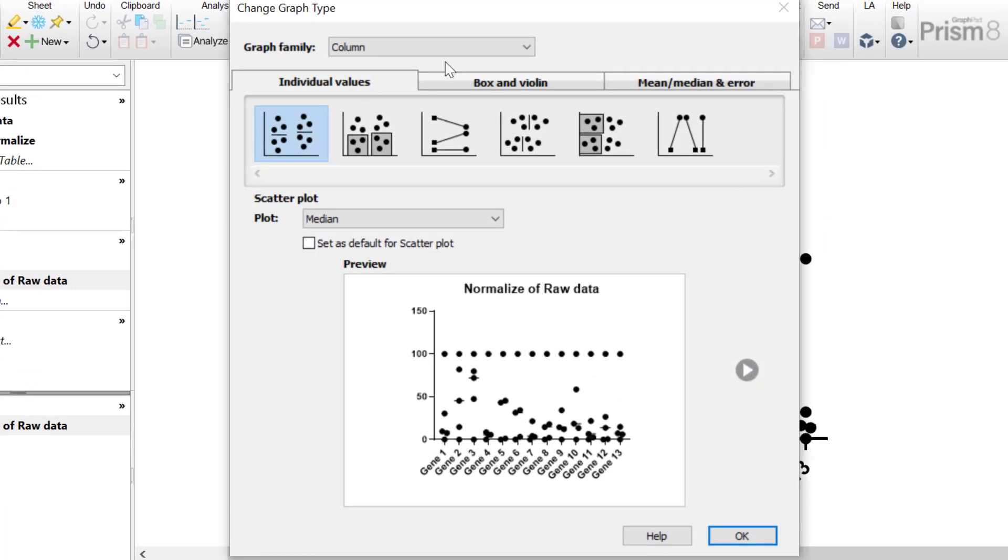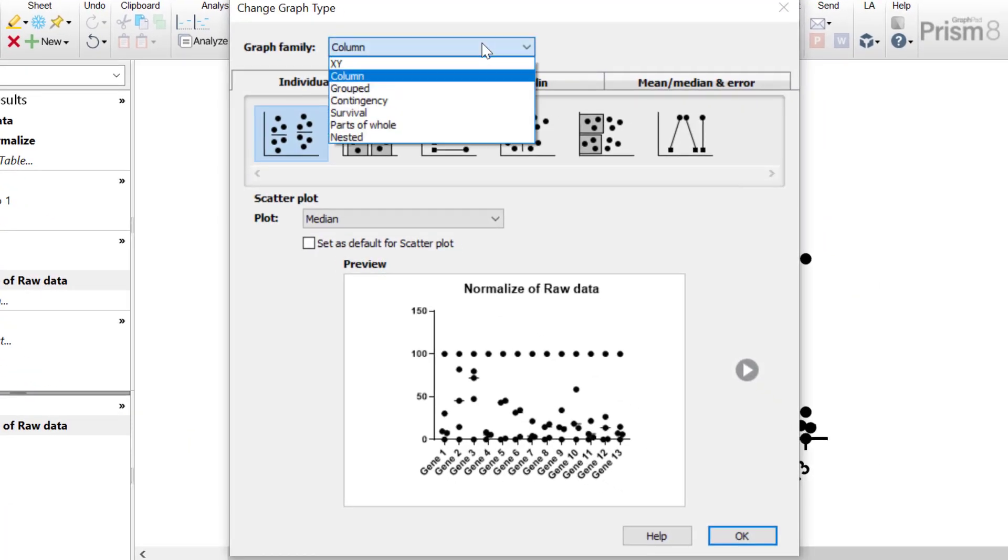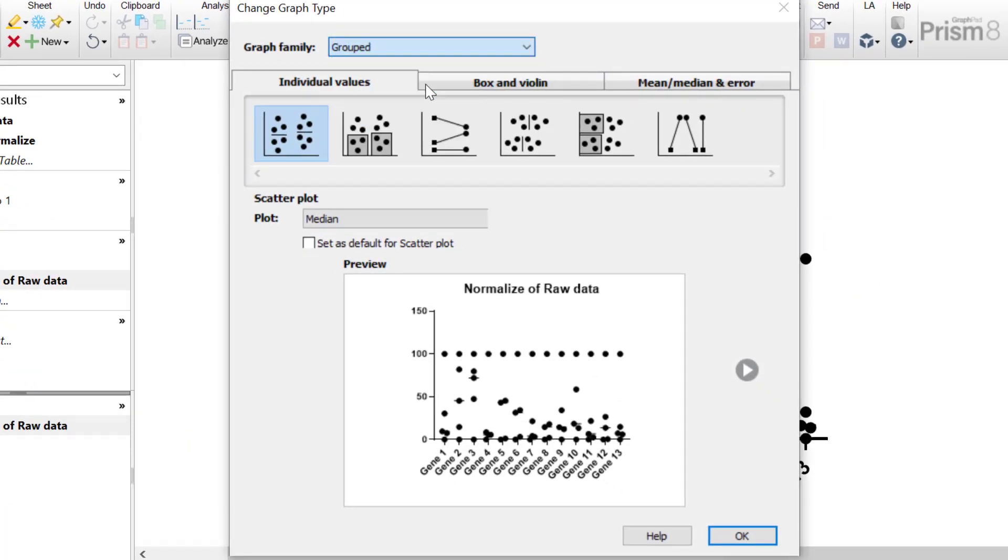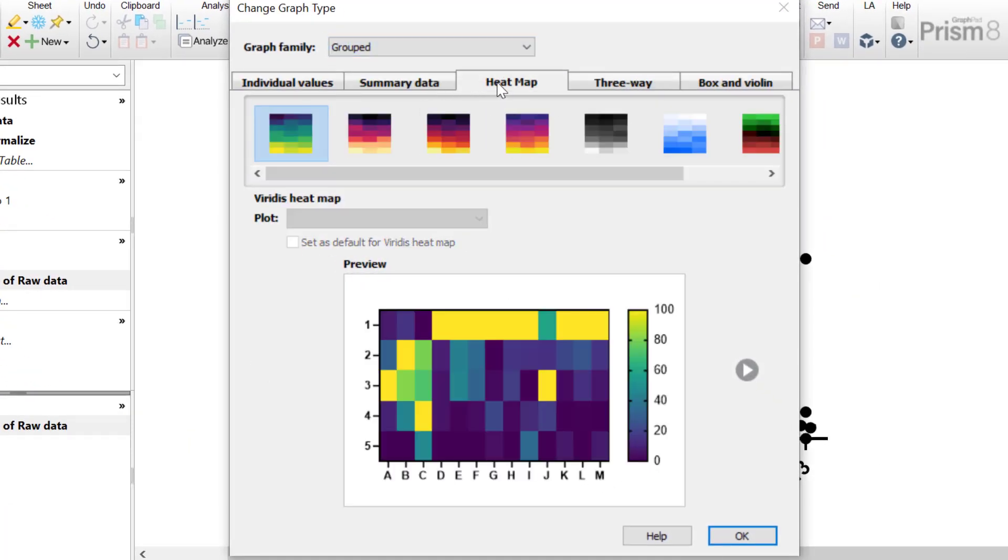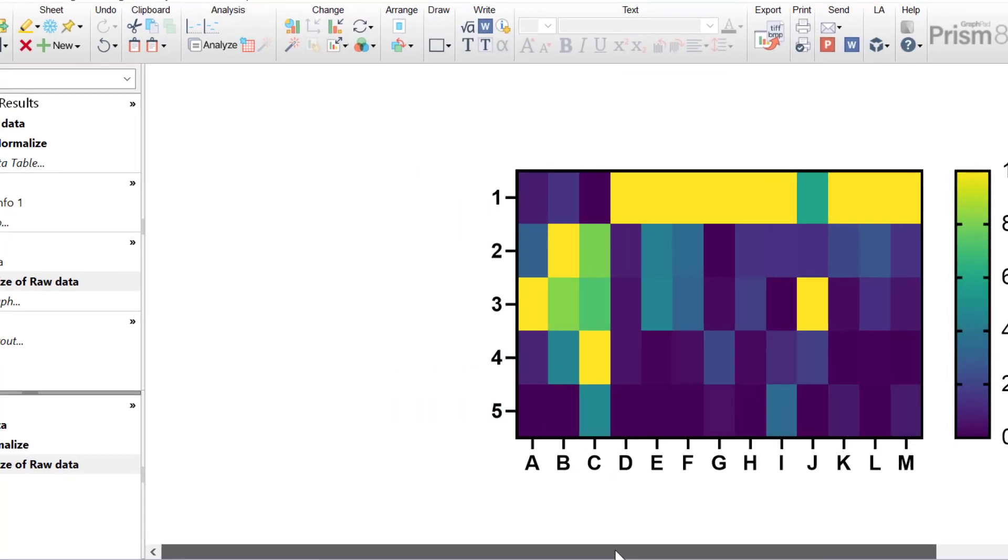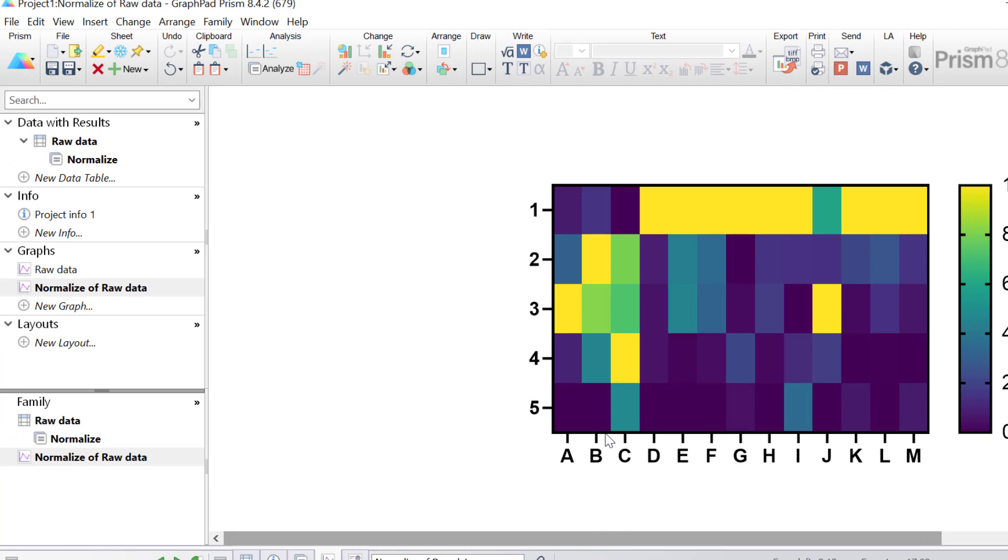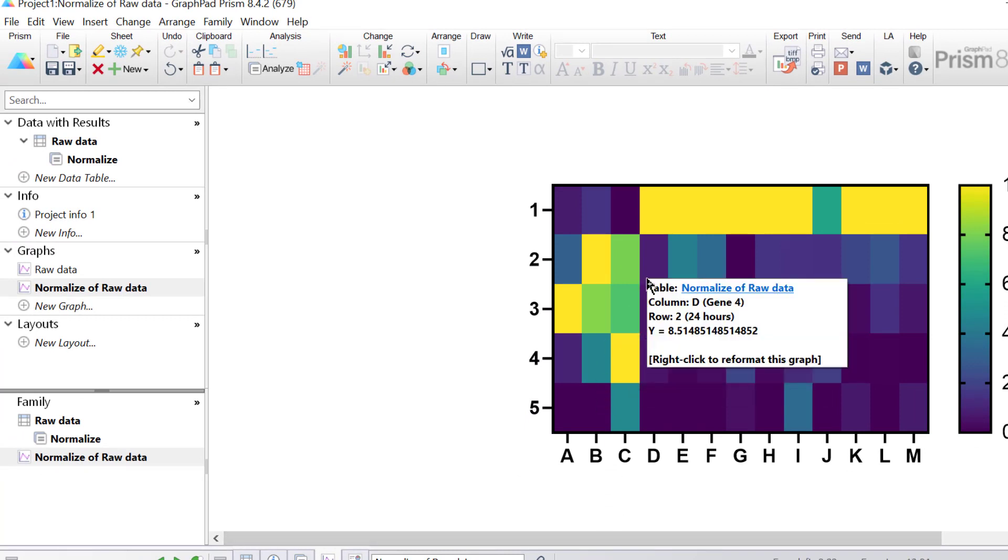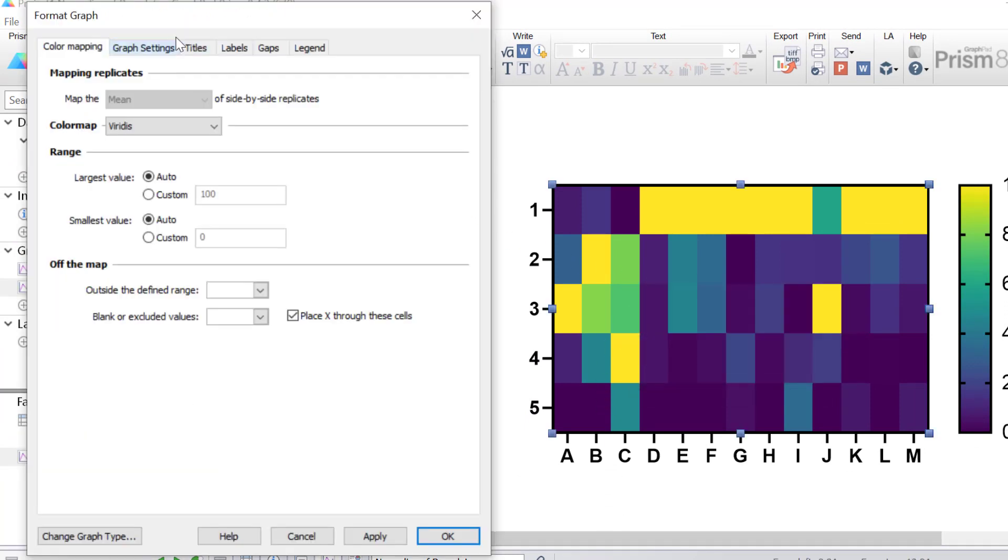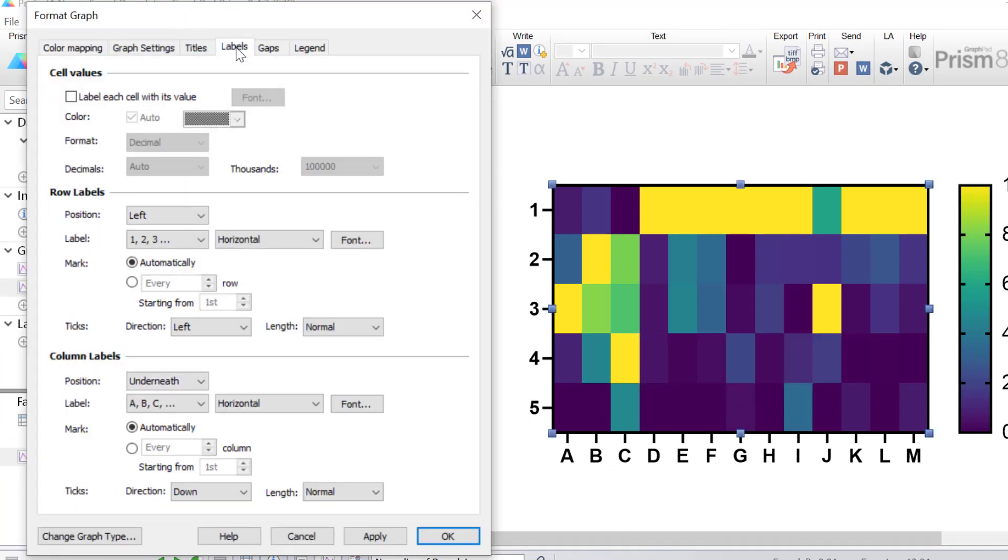I will select the grouped graph family. Again I'll go to the heatmap tab, select the Varidis heatmap option and then click OK. Again I'm going to repeat what I did before and add the column and row titles, so I'll double click on the graph and then go to Labels.